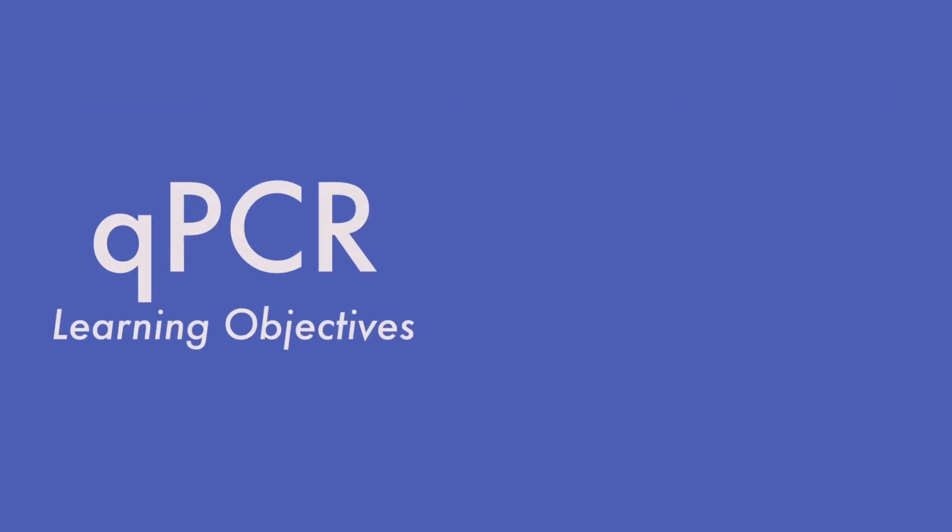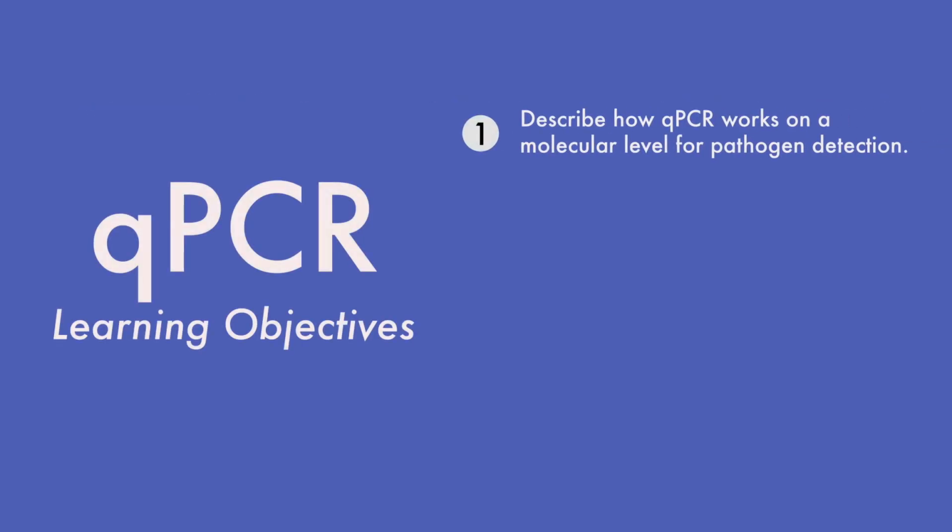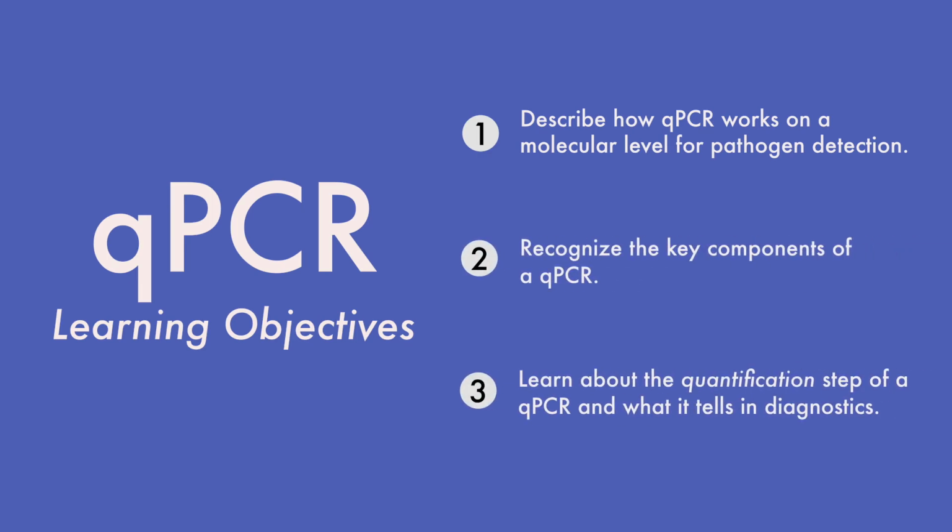By the end of this video, you'll be able to: 1. Describe how qPCR works on a molecular level for pathogen detection. 2. Recognize the key components of a qPCR. And 3. Learn about the quantification step of qPCR and what it tells us in diagnostics.